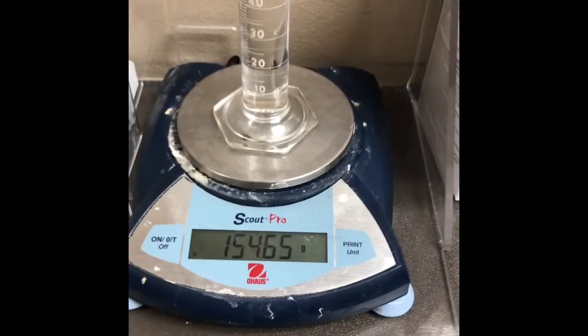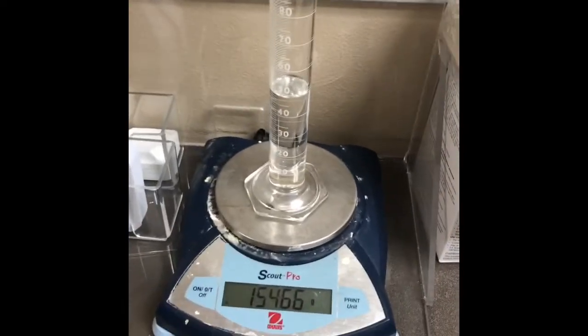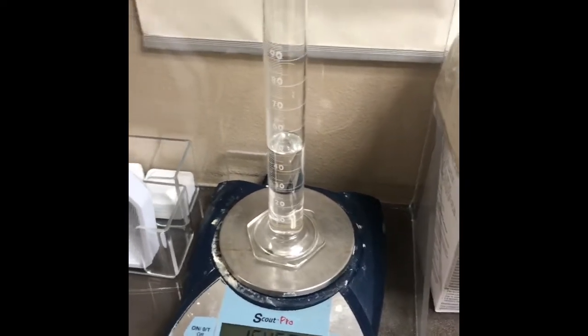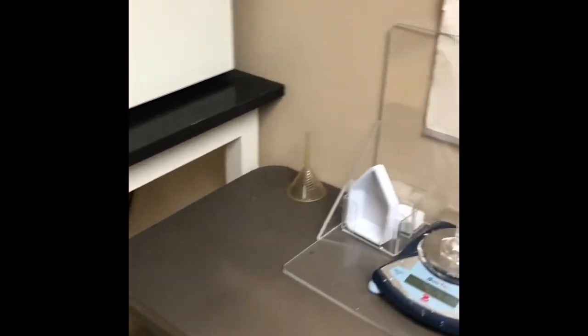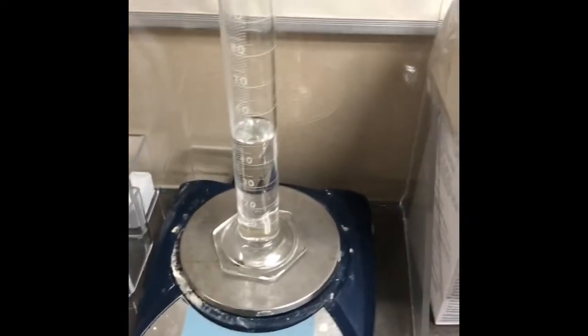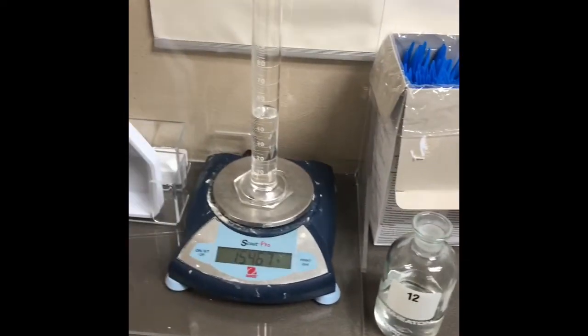I get a mass of 154.66 or 67 grams. The way we get the mass of the liquid is by subtracting the graduated cylinder mass from this mass. Our volume was about 48 milliliters. To find the density, we do mass divided by volume. So this is unknown number 12.